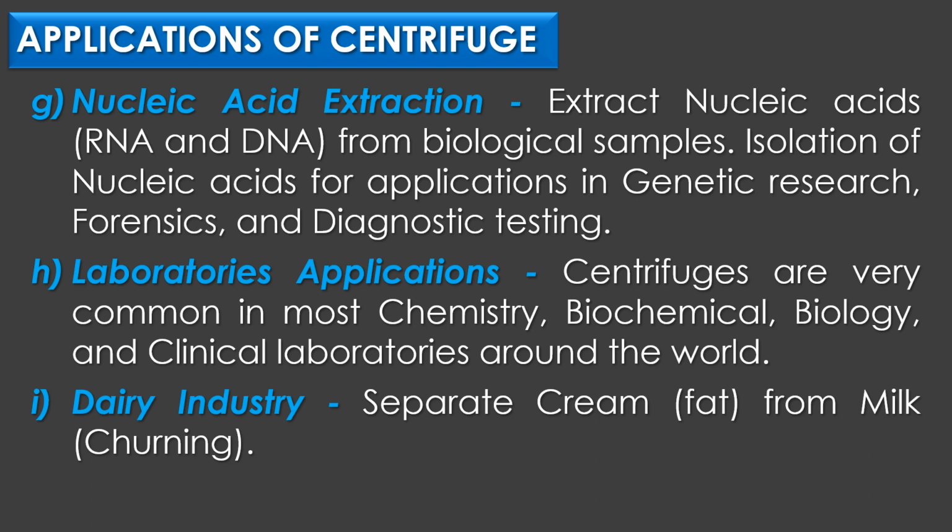The eighth application of the centrifuge is laboratory applications. Centrifuges are very common in most chemistry, biochemical, biology, microbiology, and clinical laboratories around the world. They vary widely in capabilities. Some have heating or cooling system inbuilt. Some can spin at low or high speed. Some accept various sizes of tubes. Some can spin flask or beakers, etc.